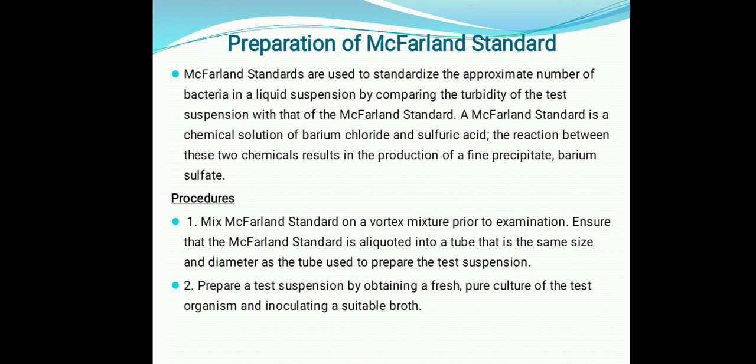McFarland standards are used to standardize the approximate number of bacteria in a liquid suspension by comparing the turbidity of the test suspension with that of the McFarland standard. This McFarland standard is a chemical solution that consists of barium chloride and sulfuric acid. The reaction between these two chemicals results in the production of a fine precipitate, barium sulfate.